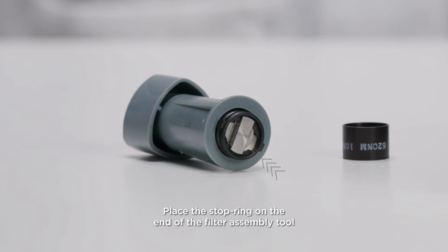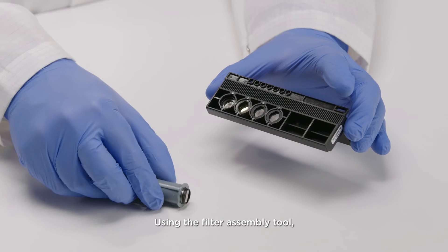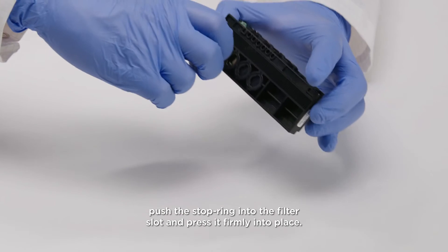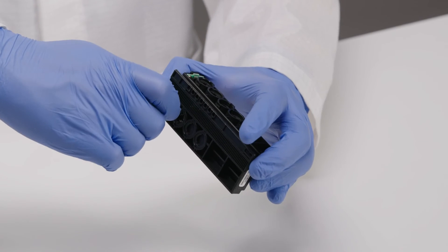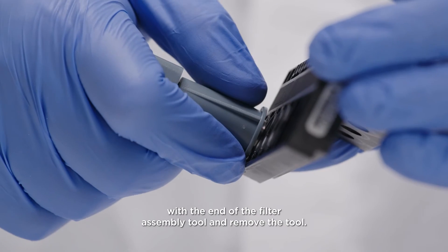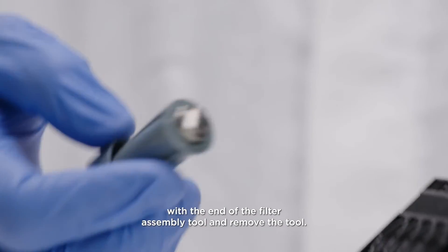Place the stop ring on the end of the filter assembly tool and turn it so it cannot slip off. Using the filter assembly tool, push the stop ring into the filter slot and press it firmly into place. Rotate the tool until the notch in the stop ring is aligned with the end of the filter assembly tool and remove the tool.